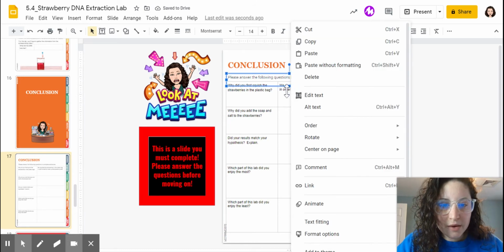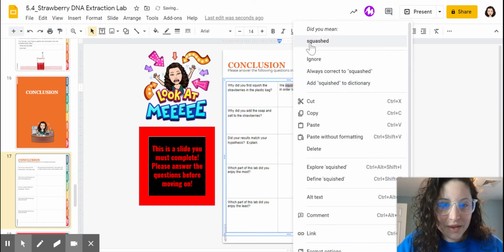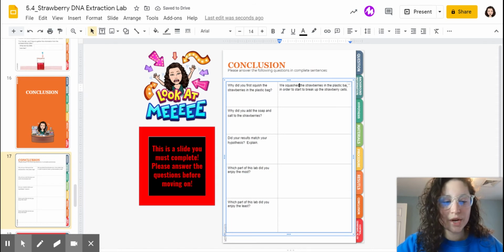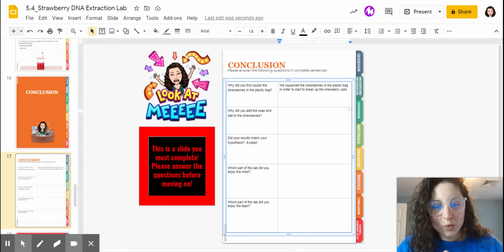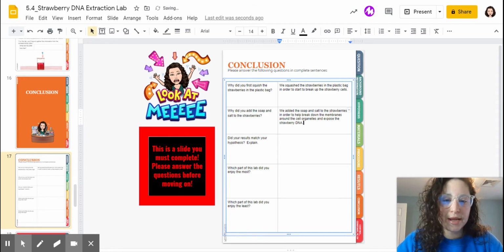So we had to break down, squished, nope. Why is this so challenging? There we go. We squished up those strawberries because we had to break down the cell membranes of the strawberry cells to release the cell organelles. So then it asks, why did you add the soap and salt to the strawberries? So we added the soap and salt, aka the extraction buffer, to the strawberries in order to help break down the membranes around the cell organelles and expose the strawberry DNA.